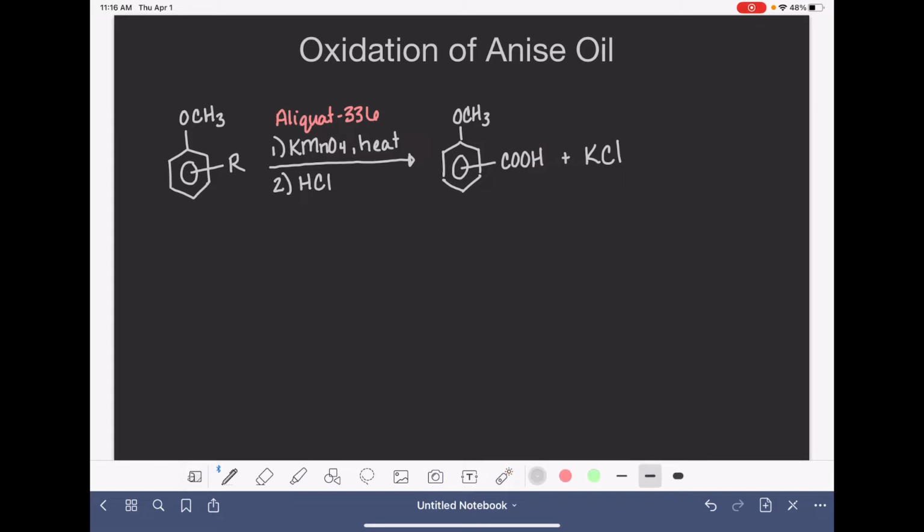The other byproduct is manganese dioxide, MnO2. The manganese dioxide is formed in the first step of the reaction. It's the byproduct of the oxidation process. When the potassium permanganate reacts with the original molecule, some manganese dioxide is synthesized in that step.